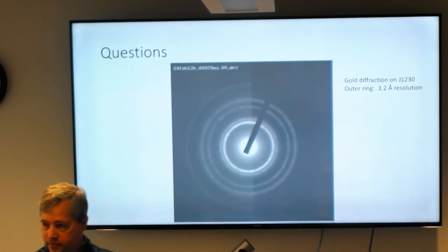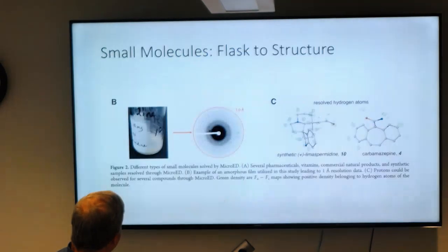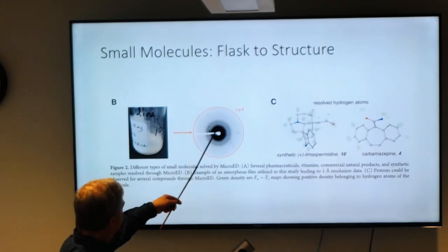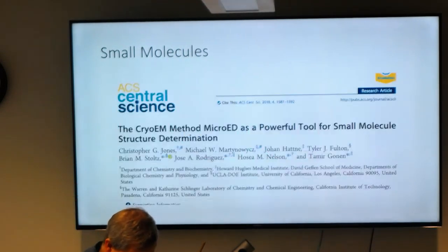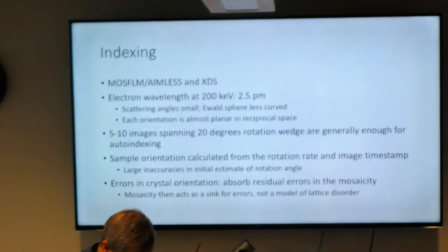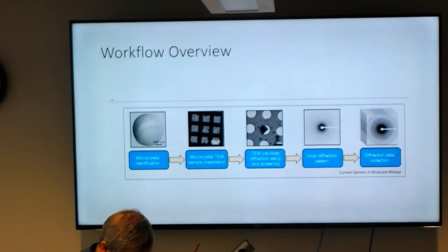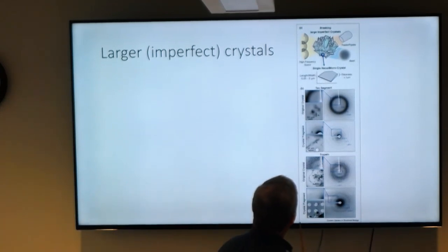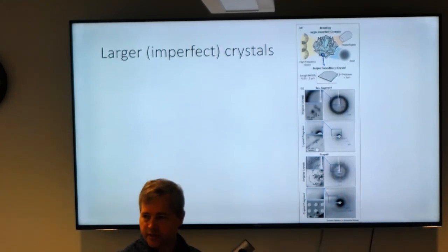I guess in some of the diffraction patterns you showed earlier, there's a darker halo around. Is that the ice ring? Probably, it depends which. There's probably no ice here, so this might be something else. It was really prominent in the first one that you showed. There was some in there. This is 3.3 here, so this would be around 4, so this could be an ice ring, yeah. Chances are it is a little thicker around the crystal.